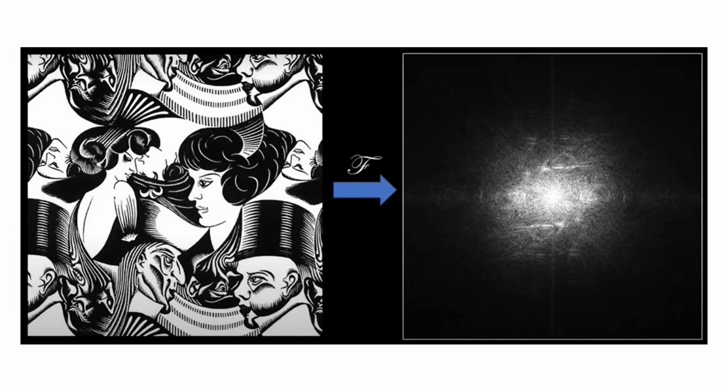Therefore, if the right half of the Fourier plane is blocked by a semicircular half-stop, there is still sufficient information remaining to form a complete image, and also the contrast becomes enhanced, as explained below.